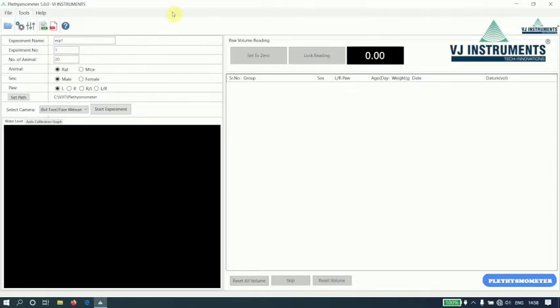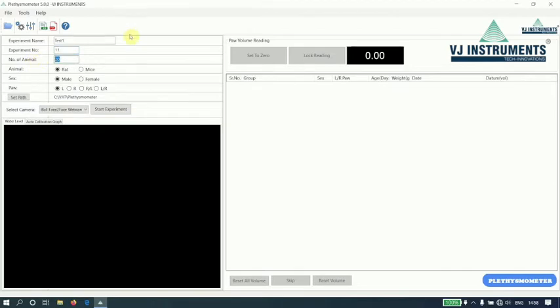Before we start the experiment, let us enter experiment name, experiment number, number of animals on which we are going to perform experiment, type of animal, sex of the animal, and the paw.